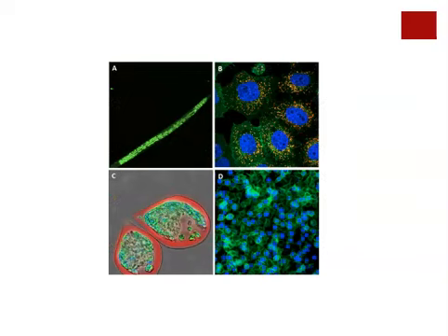The images on this slide were taken with a fluorescent microscope, and I think you can see the colors are pretty remarkable. One of the nice things about fluorescence microscopy is that we can combine the fluorescent tags that we use. So, for example, you can combine a fluorescent molecule that will bind to the membrane of a cell and show this bright red color, while also tagging the cell with a molecule that binds to internal structures, shown in green here.